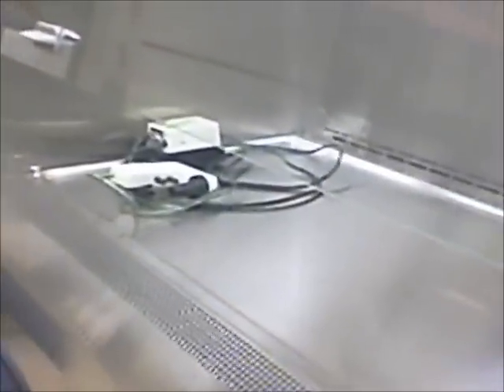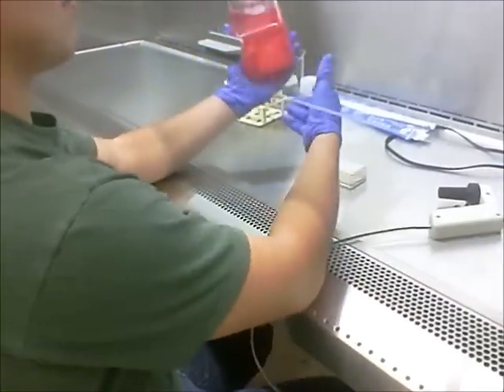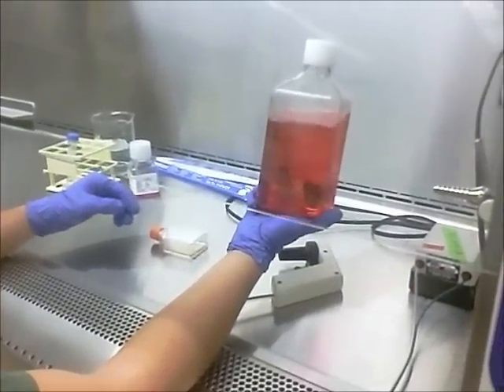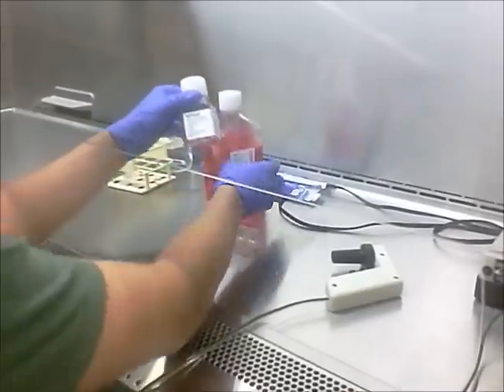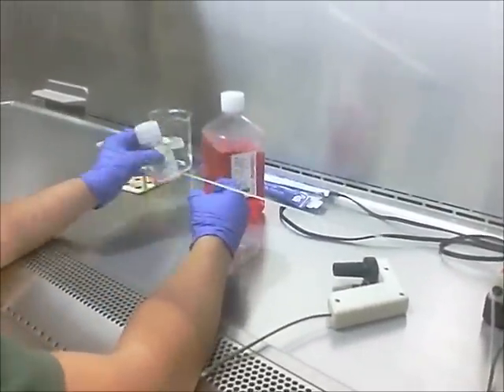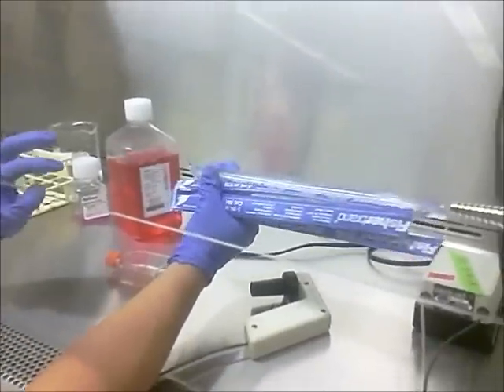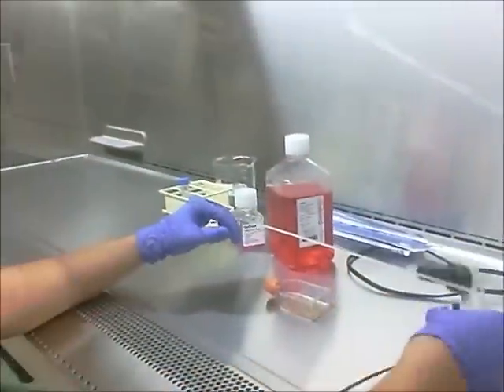Now that all the surfaces are clean, we can begin passaging cells. This is our flask of murine embryonic stem cells that we're going to be passaging, and this is a view from the inverted microscope of our murine embryonic stem cells. Over in the hood with Josh, before we begin we need to make sure we have all the correct materials: complete media, trypsin, a centrifuge tube, a pipette, a waste jar, and a mechanical pipette aid.